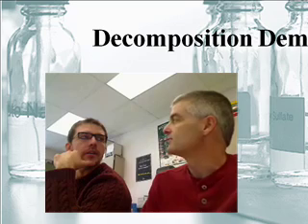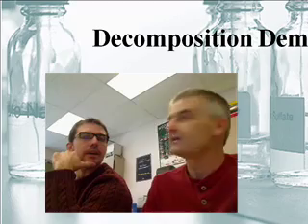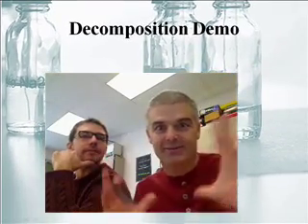Now, I think we should do a demonstration. Video. Okay, so who's going to video us? I think it's you this time. Is it me? I get to decompose and fire. I get to play with fire.